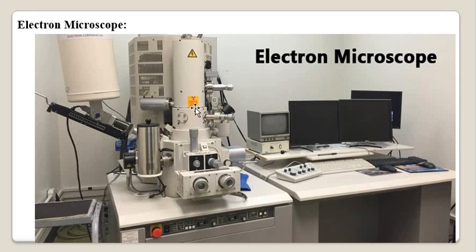So in short, it is big and complicated, and just simply keep in mind, the electron microscope uses electromagnetic coils or electromagnetic lenses, which are nothing but the condenser electromagnetic coil, objective and ocular electromagnetic coils, which serve the function of a magnification system. Then a fluorescence screen is there.